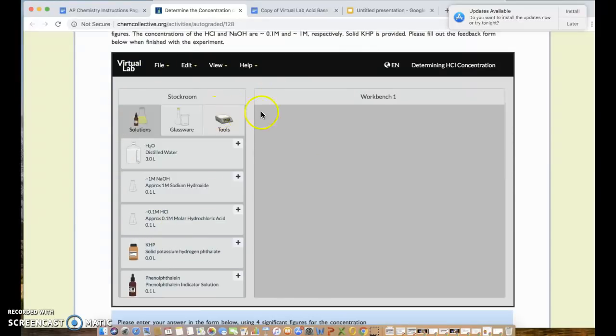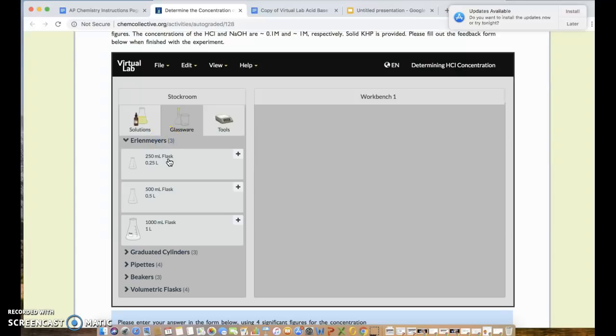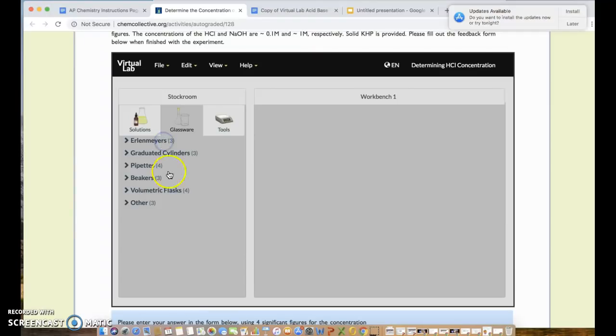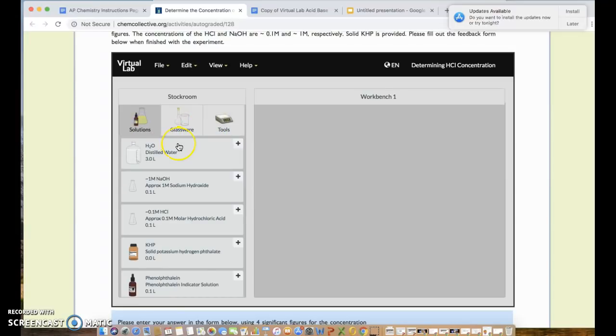On the left-hand side you have your stock room; on the right-hand side, the workbench. Items from the stock room are dragged over to the workbench. The stock room has three parts: solutions — we'll be using all the solutions shown — glassware, where the only piece we need is a 250 mL Erlenmeyer flask, and under 'Other' is where you'll find your burette. We won't be using a scale; we'll use the virtual lab method for weighing.